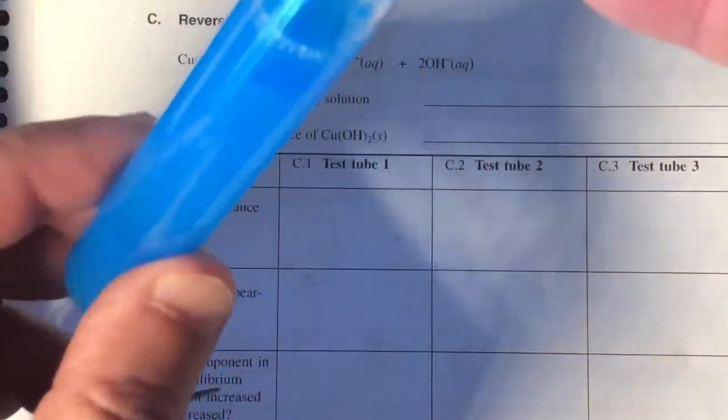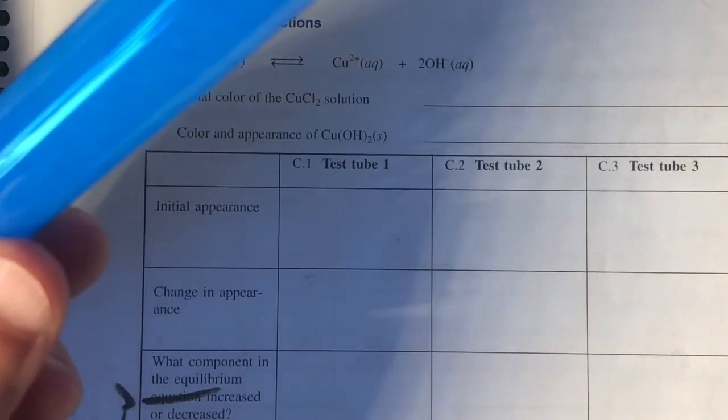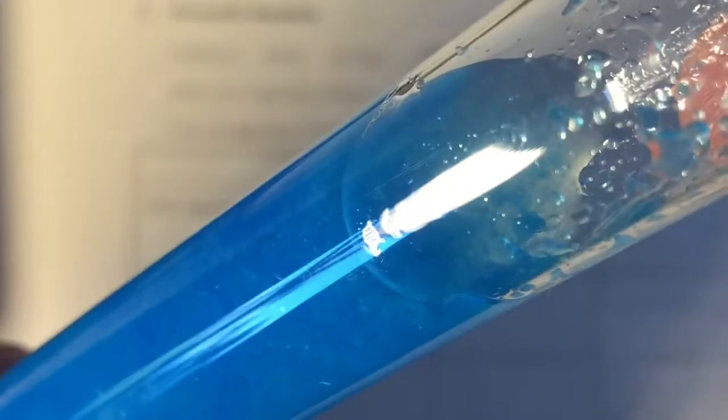Shake it up and I have this sort of dark blue material, and that opaque material here is the copper hydroxide. All right, then I need to put this into 3 clean containers.